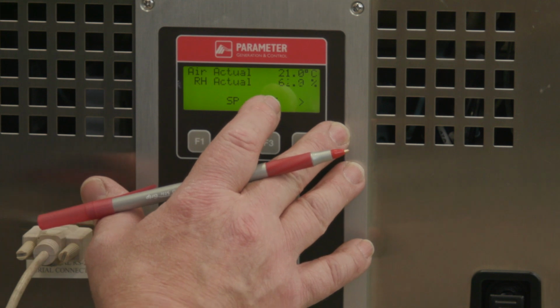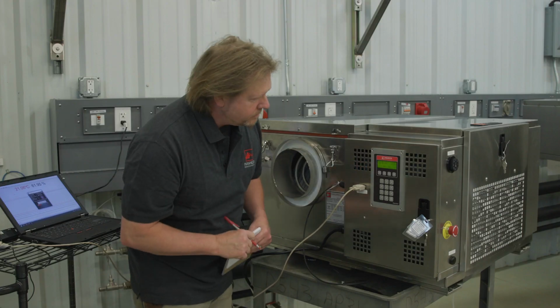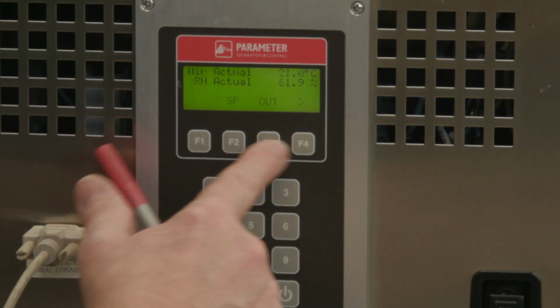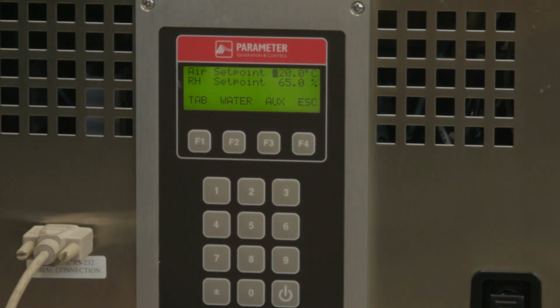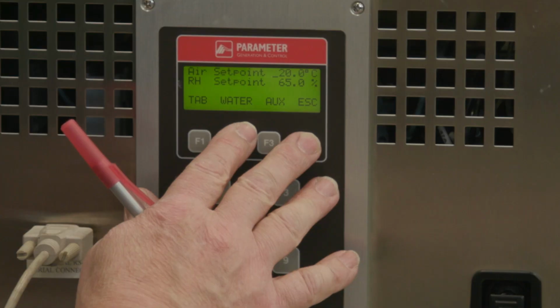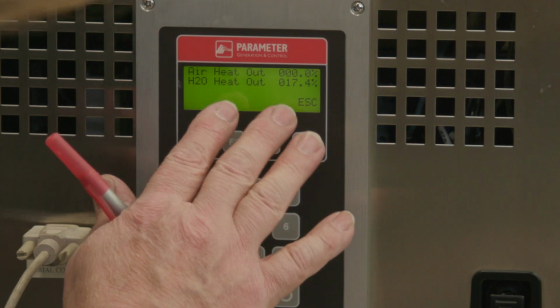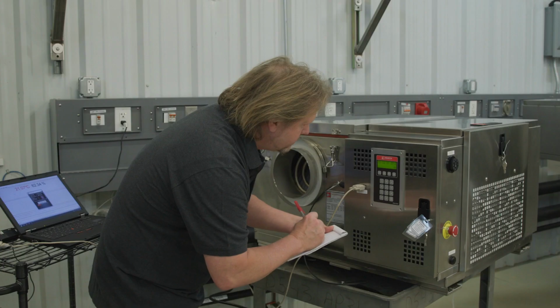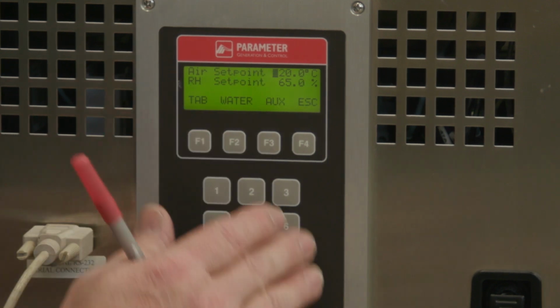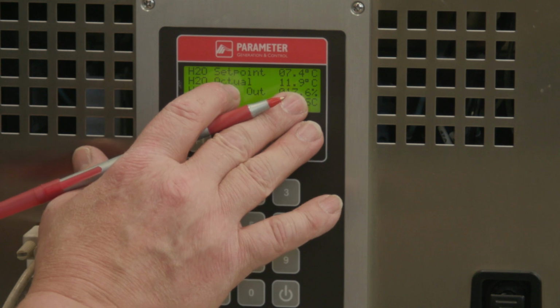Document the chamber's mode of operation. And document the chamber's set points. Verify if the chamber controls air temperature. Document the air heater output percentage. Verify if the chamber controls water temperature. Document the water heater output percentage.